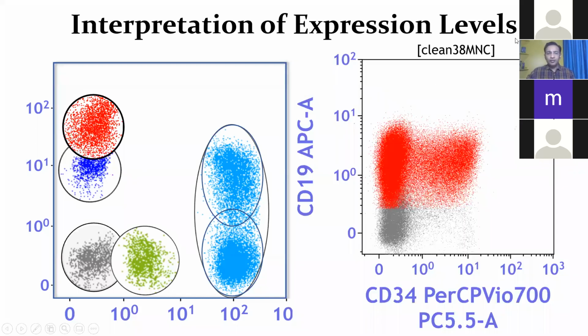You can see here there are two clusters for this blue population. One is above 10 to the power 0 and one is below. Now this is the same population. We identify the same population by using different markers. This is tumor. For example, if this is B cells or CD10 positive follicular lymphoma, we are saying, because we have confirmed by using light chain restriction, these blue cells are all tumor. But if we look at CD10, which is partly positive and partly negative, we call it partial.